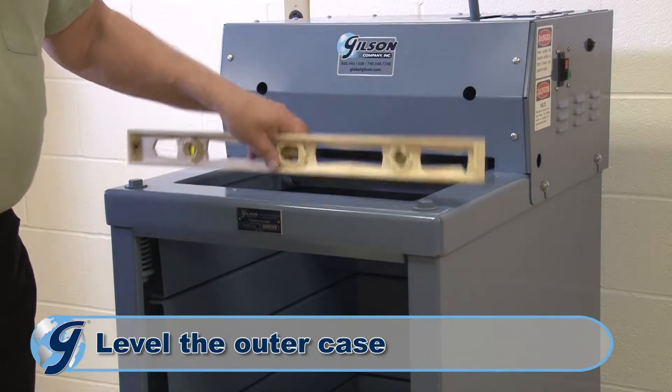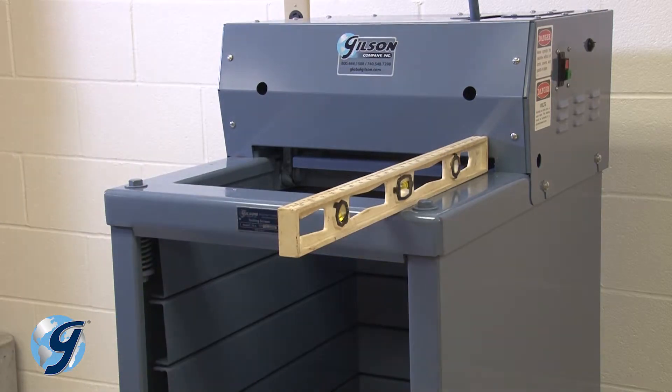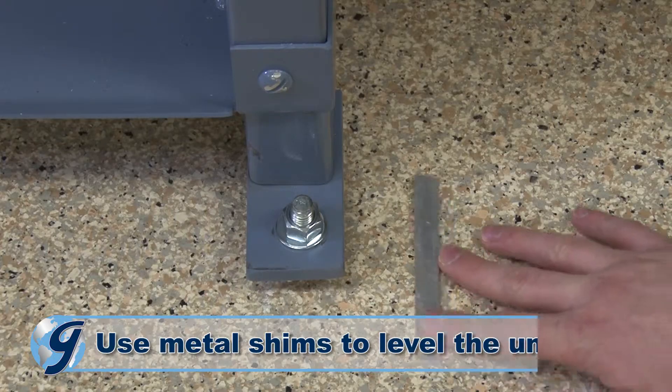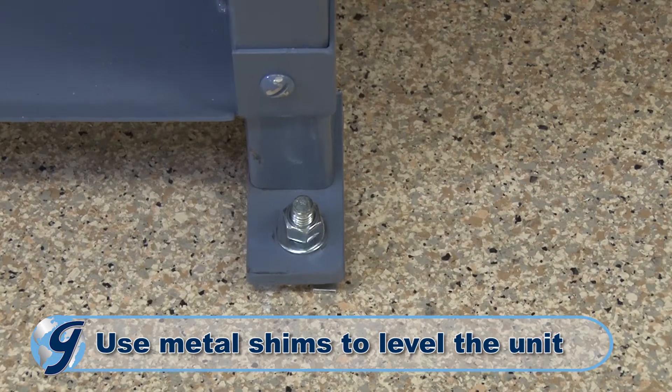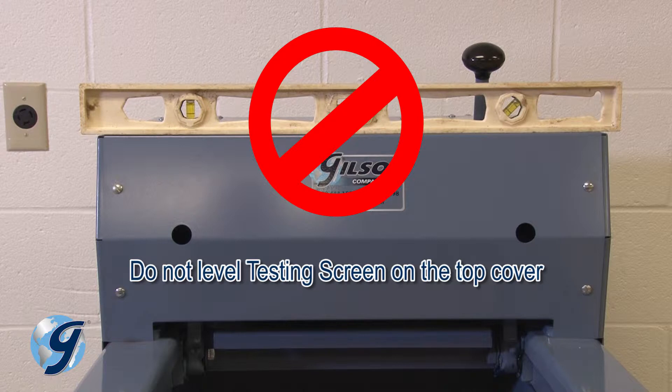Perform an initial leveling of the outer case — front to back, side to side — by inserting metal shims under the feet until the top of the unit is level on all four edges. Do not level the unit by the top cover.